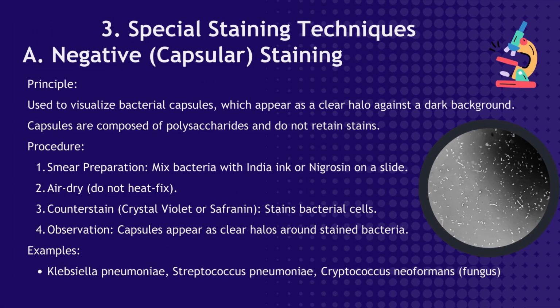Special staining techniques: negative, capsular staining. Principle: used to visualize bacterial capsules, which appear as a clear halo against a dark background. Capsules are composed of polysaccharides and do not retain stains.